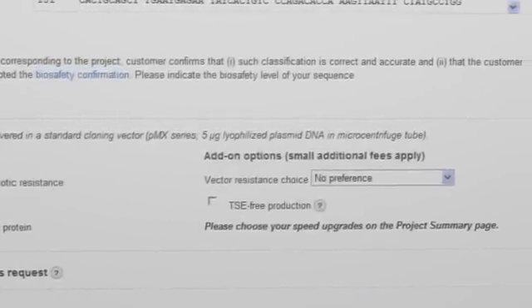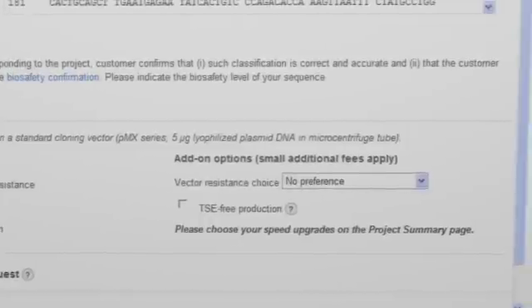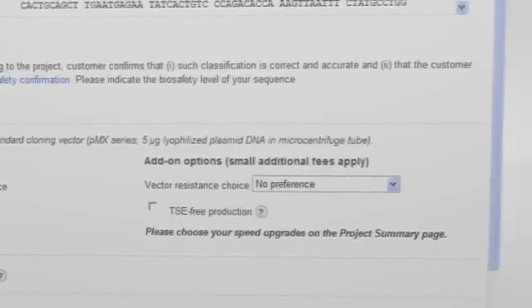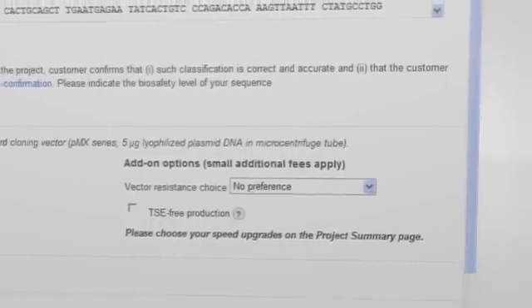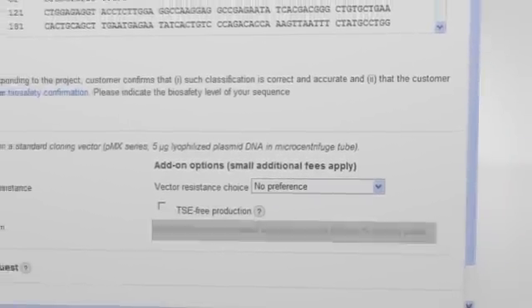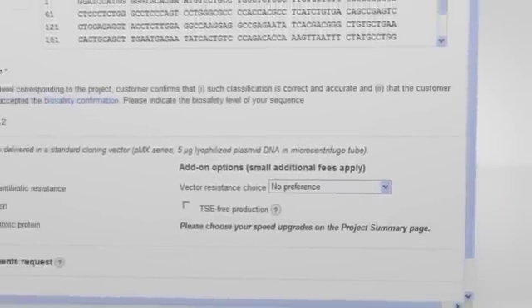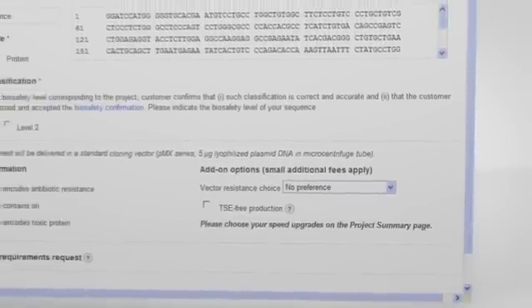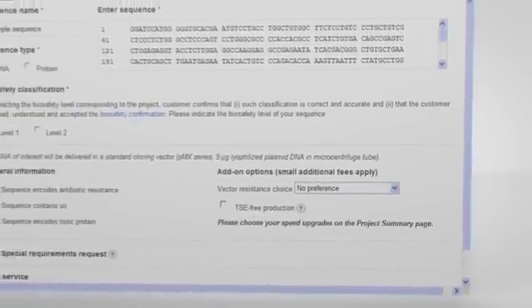Note that Express or SuperSpeed service can be chosen later in the process on the Project Summary page before adding your project to the cart.